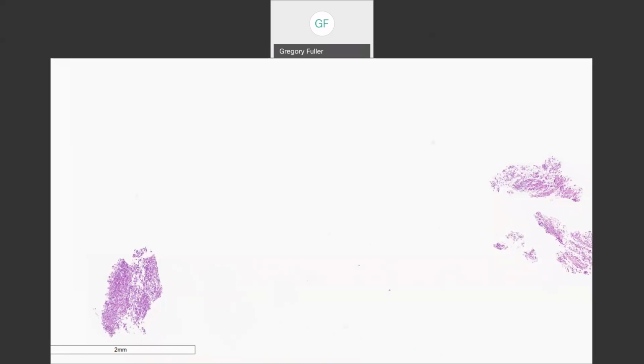Same thing for tiny stereotactic biopsies. Pick up the specimen gently with your forceps, touch it 1, 2, 3 times, or drag it back and forth on the slide, then slide straight into the alcohol. If it's a tumor that sheds, like germinoma or a metastasis or lymphoma or oligodendroglioma or central neurocytoma, those will all shed cells.